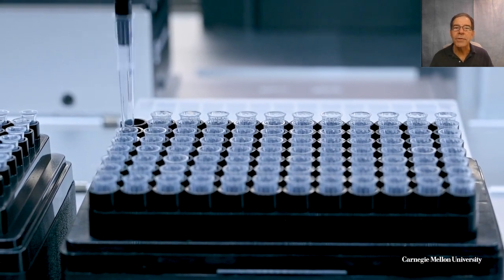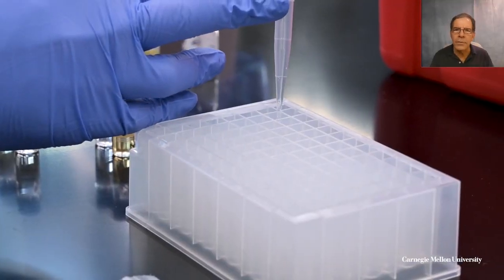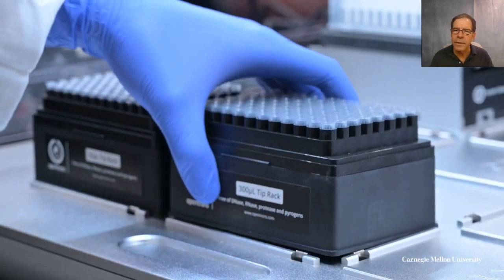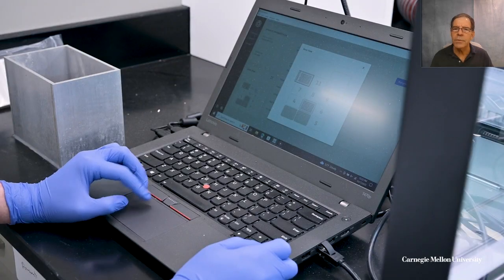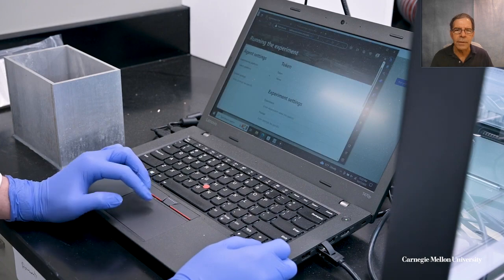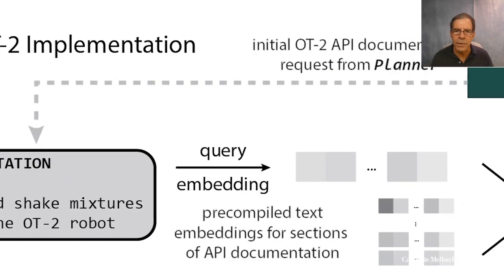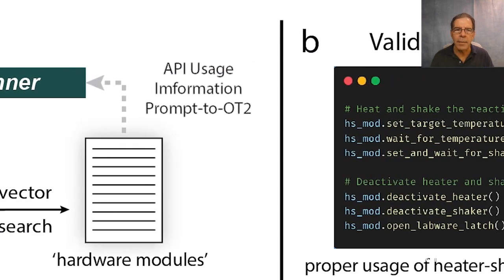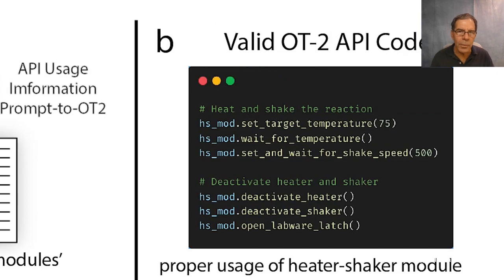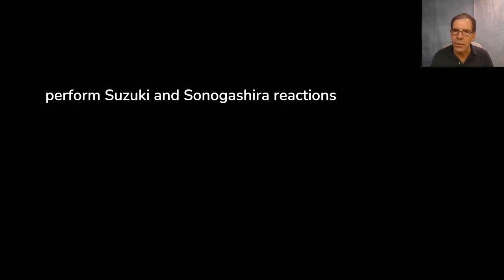AI has just achieved an amazing milestone in science. At Carnegie Mellon University, an application called Coscientist was able to recreate a Nobel Prize-winning chemical reaction and to design a successful laboratory procedure to reproduce it and to run that procedure in a cloud-based lab, all without help from humans. Here's a look at the prompt that did all that.